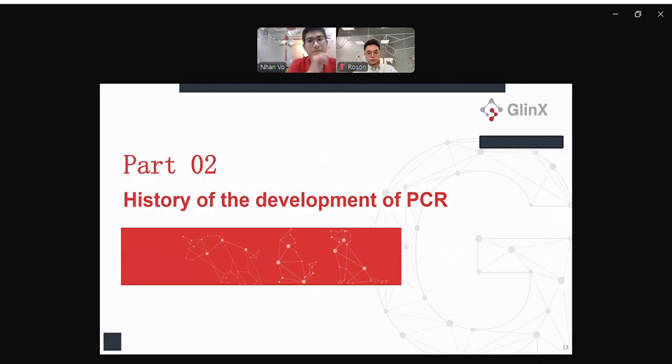For the second part, we can have a look at the history of the development of PCR. After we finish part one, the most important thing we would like to express is to let you clearly know that PCR is not equal to nucleic acid testing.